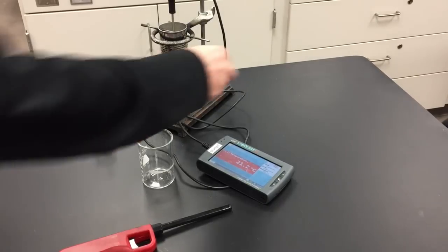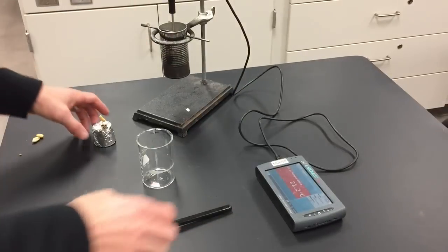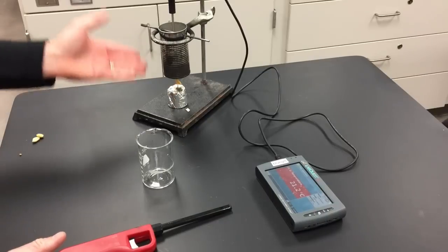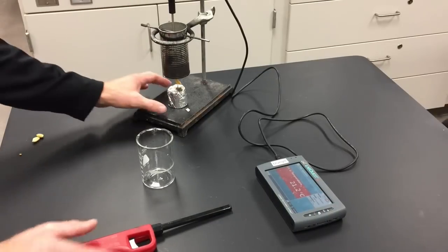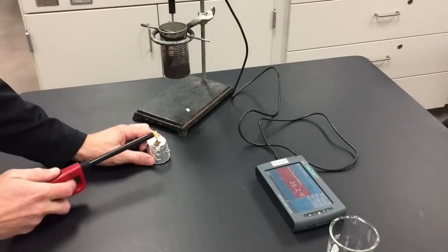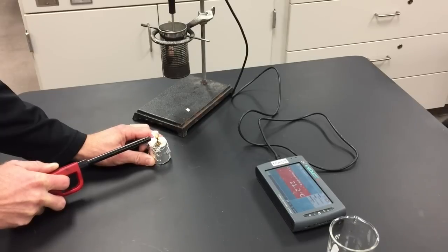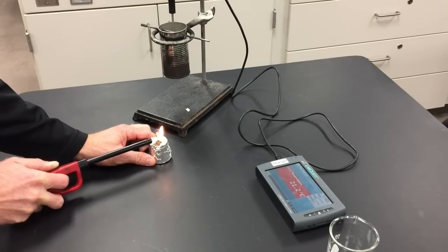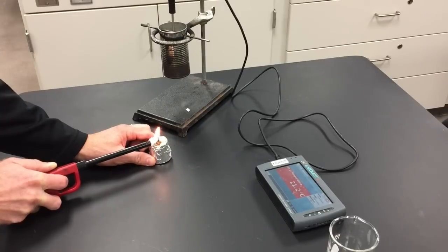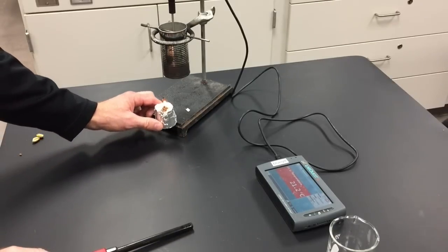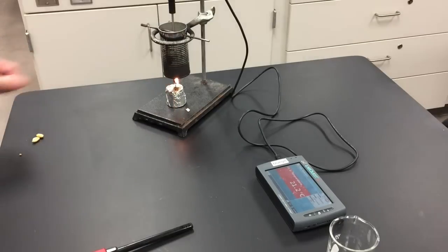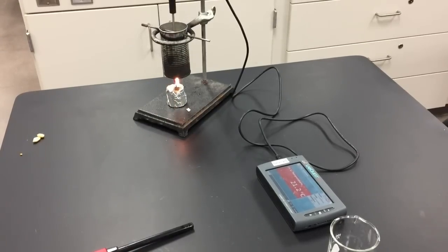Place the food item, make sure that it's under the can with enough space. Adjust it if you need to. This looks okay. Light the food item on fire, away from the water. Carefully transfer it underneath the can and allow it to burn completely. If it goes out, you can relight it if you need to.